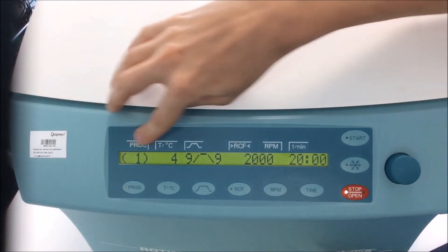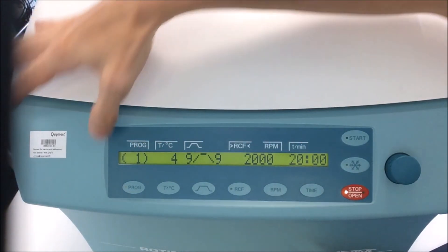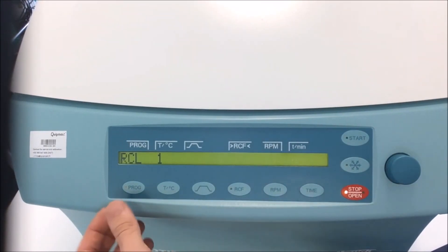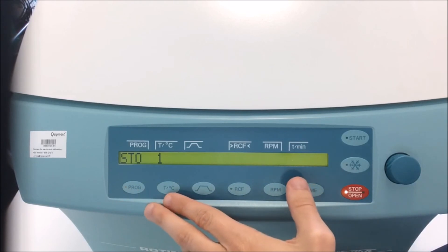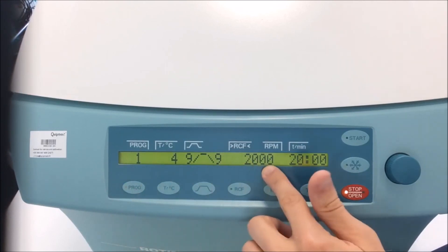If I want to save this new configuration as program number 1, I can select program, press on prog again. And you got STO, that's for storage. So you can store this new program and replace it. So now my default program number 1 is this one.